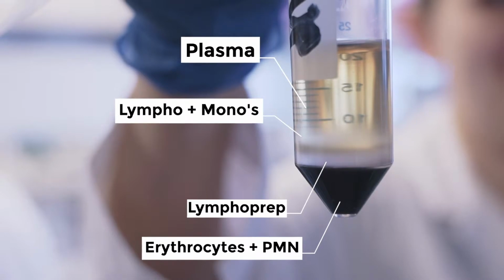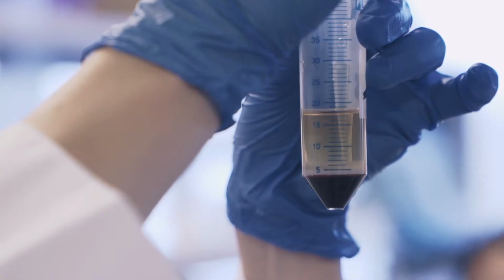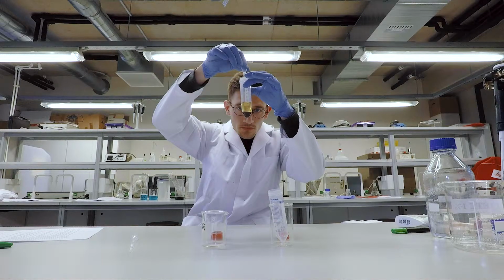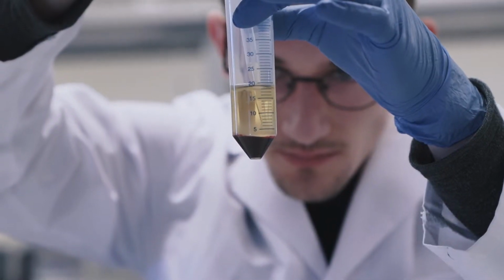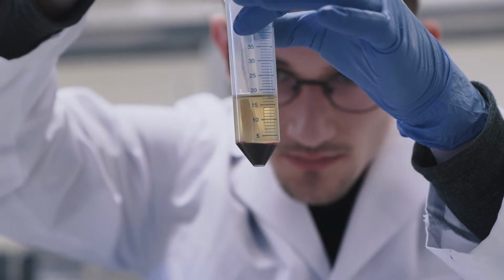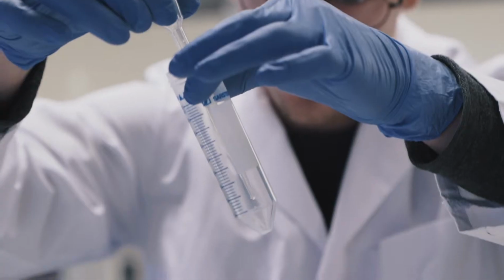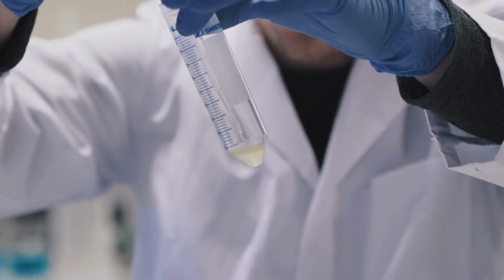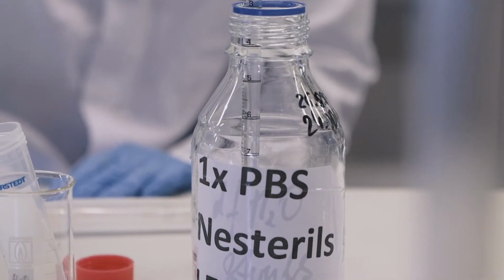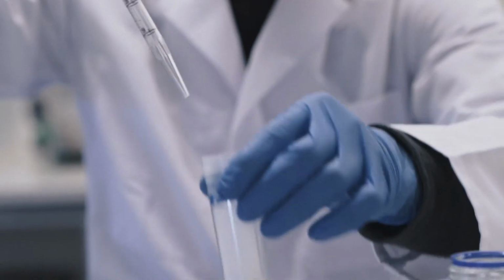So the white blood cells are on top of the lymphoprep, and you just pipette them out by using a small pipette and doing it as if you have a vacuum cleaner on top of the white blood cells and take them out. Stay away from the red pellet and then transfer the lymphocytes into a new tube. We want to wash the lymphocytes to get rid of all lymphoprep. Therefore we add some PBS and then we recollect the lymphocytes by centrifugation.